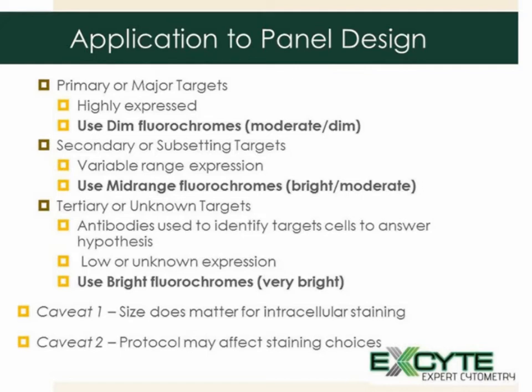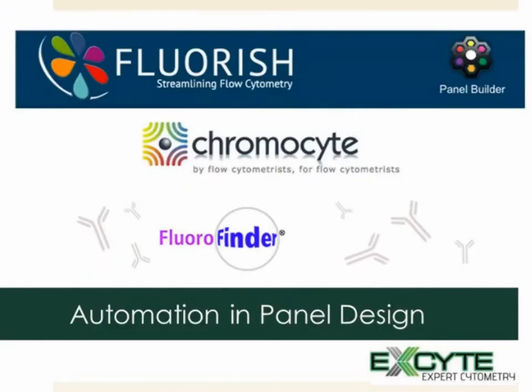The second caveat about panel design and fluorochromes is protocols may affect your staining choice. Depending on what your protocol is, especially if you're going to be doing fixation permeabilization, you may have to compromise and make certain choices because some fluorochromes hold up to fixation permeabilization better than others. So those two caveats have to be taken into account when you design your panels.